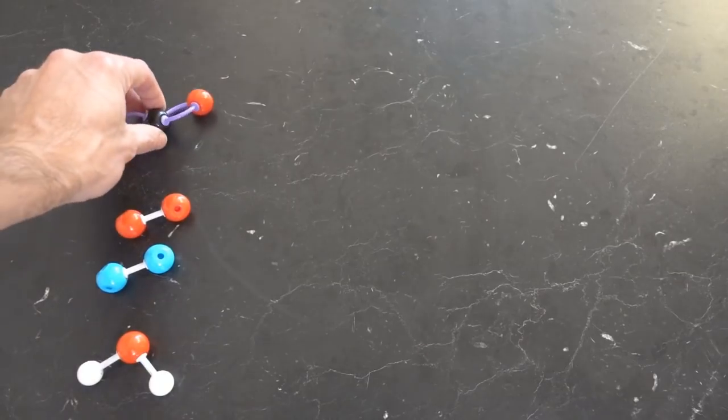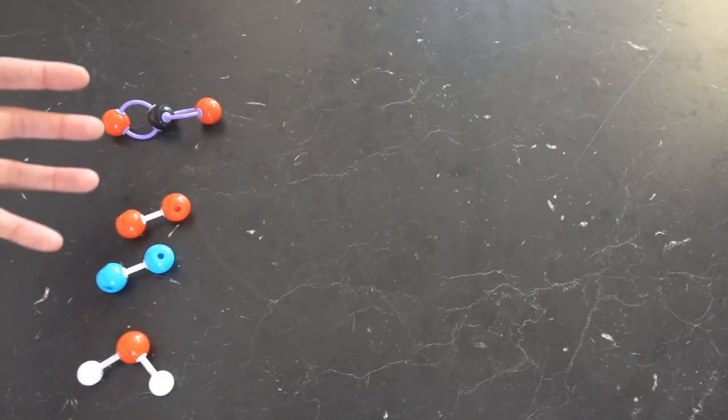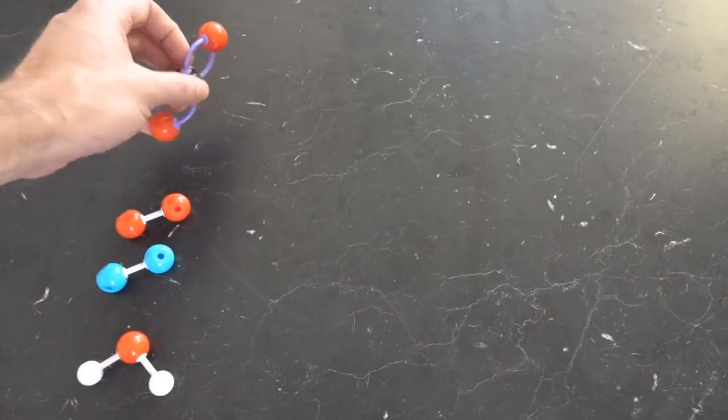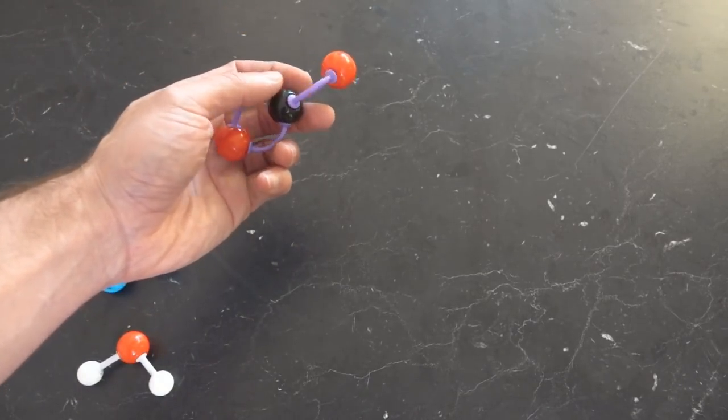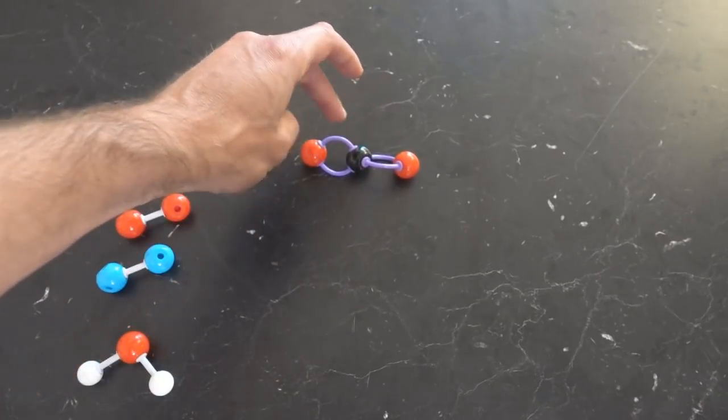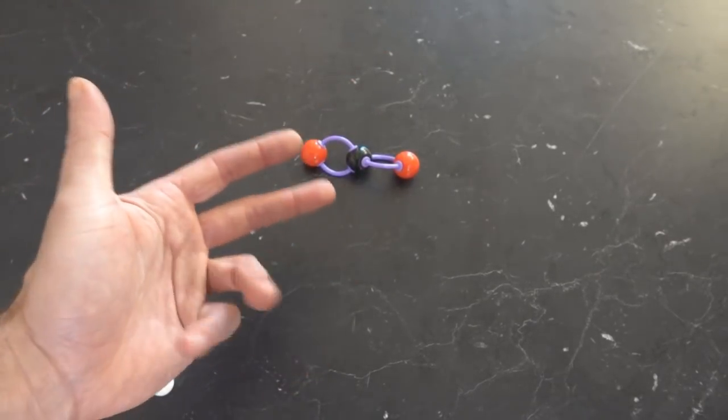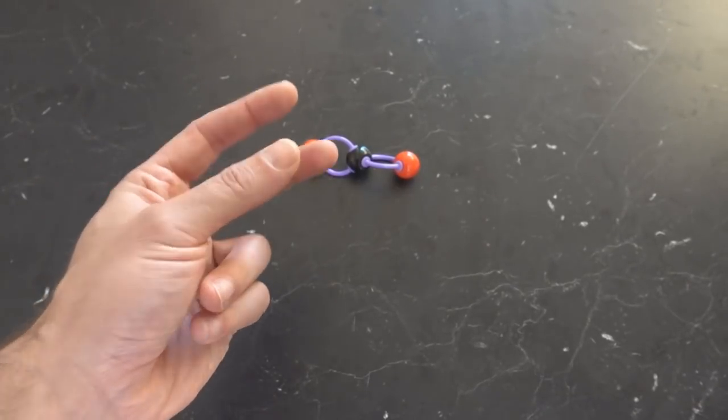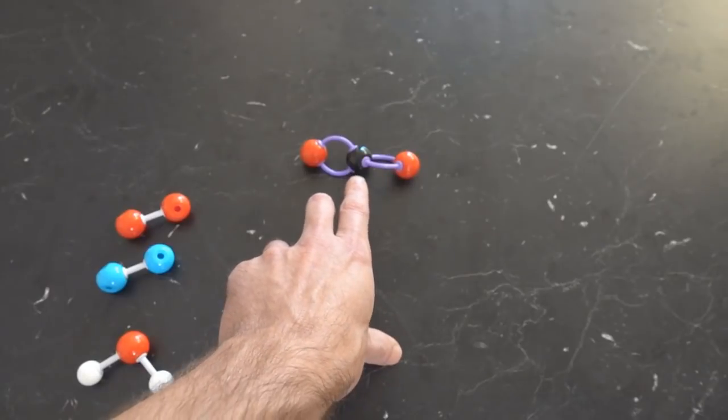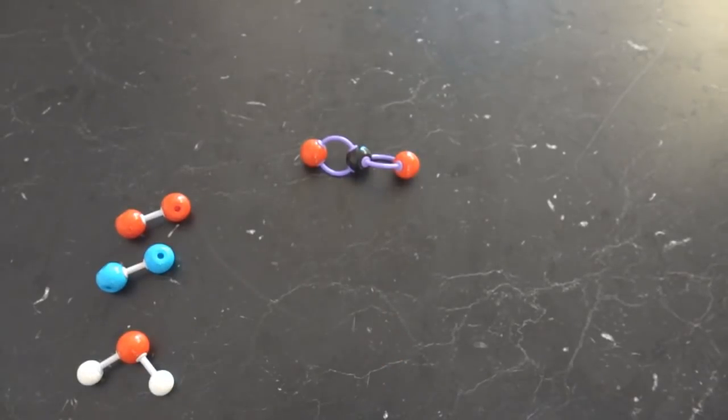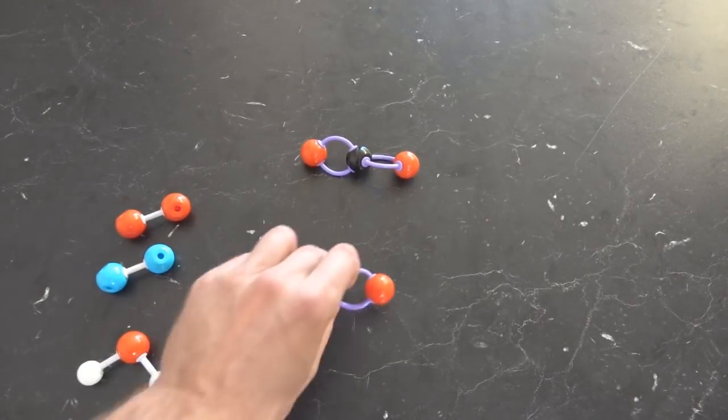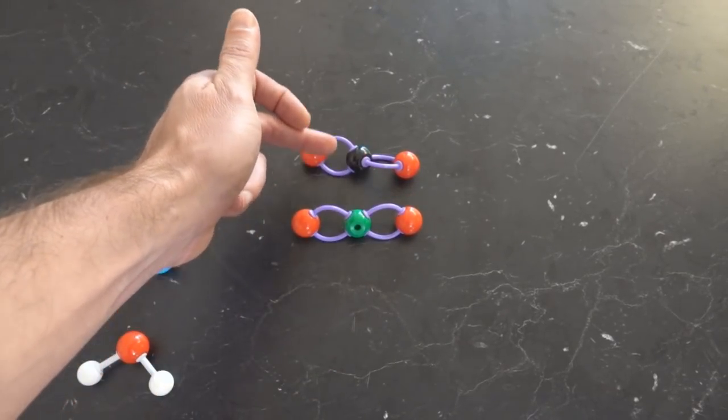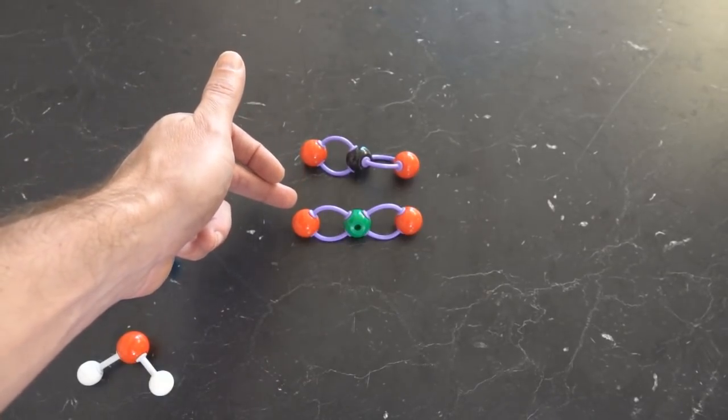But this isn't much use. You could do this with much simpler and cheaper methods. What I want to do is label one of these with an isotope. Just like the uranium-235 and 238, they have the same chemical properties, but they weigh different amounts. You can get a different isotope of carbon here. For instance, carbon-13. So this weighs slightly more than this. So this weighs 44. This weighs 45.